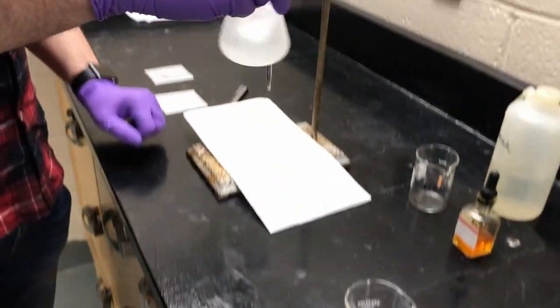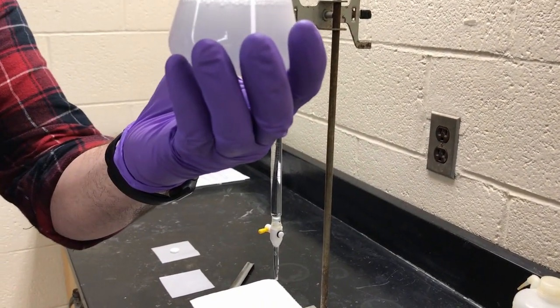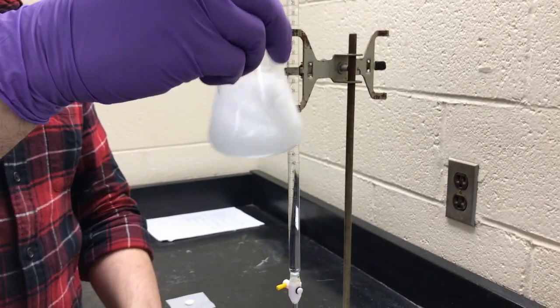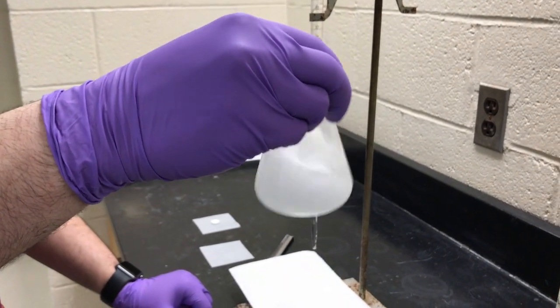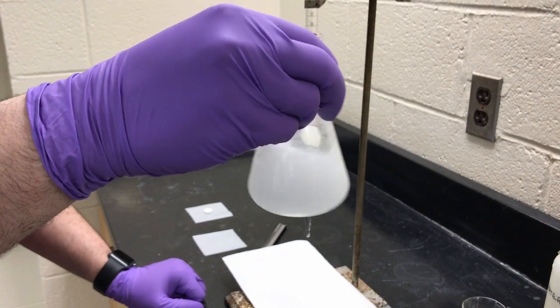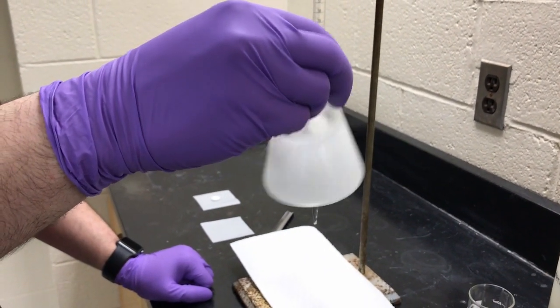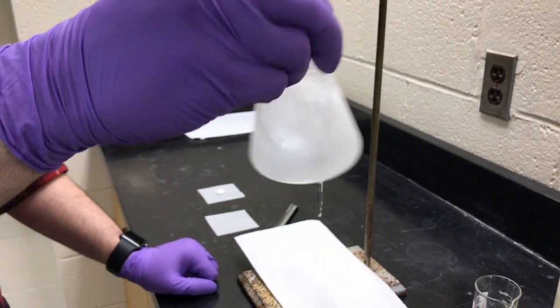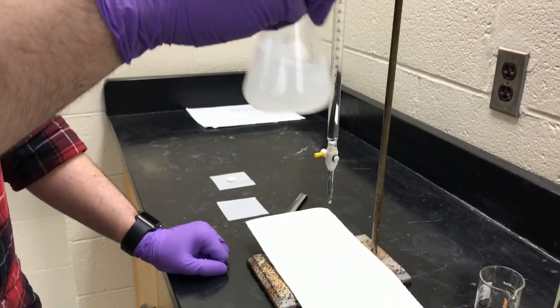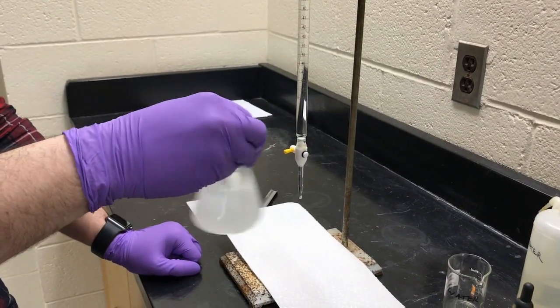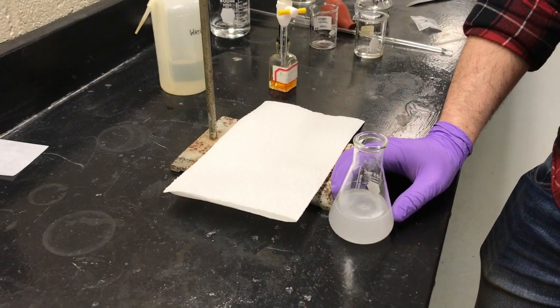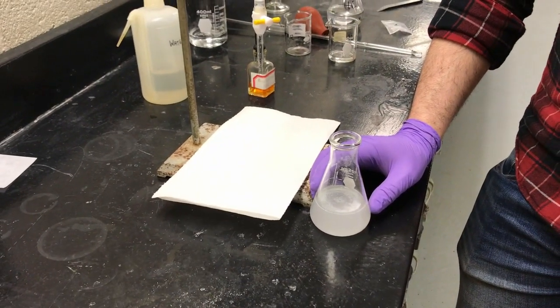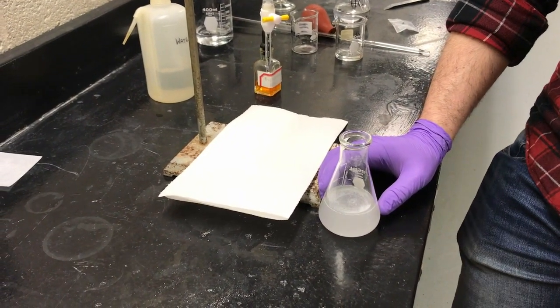So now I'm just going to swirl it. Now, if you notice, it's bubbling a little bit. And there's this white, it's not really clear. So these antacid tablets have binders in them that keeps everything together, and then once it hits your stomach, well, you chew it apart, and then once it hits your stomach, then it releases the calcium. I'm sure this is a calcium tablet. Do you hear them? I do. I hope they can. So I'm just going to swirl it for a little bit. So now the tablet has mostly dissolved except for the binders. So now we're going to determine how much HCl is still left after the tablet reacted with some of the HCl that's in here.